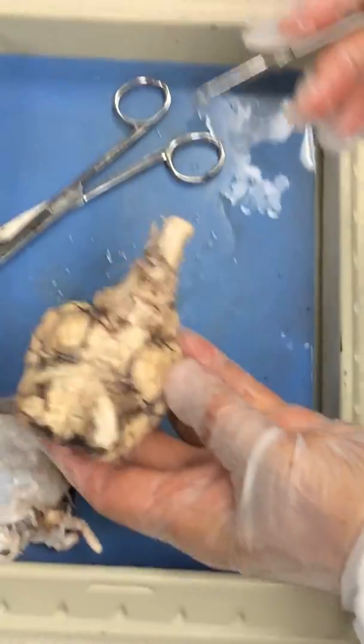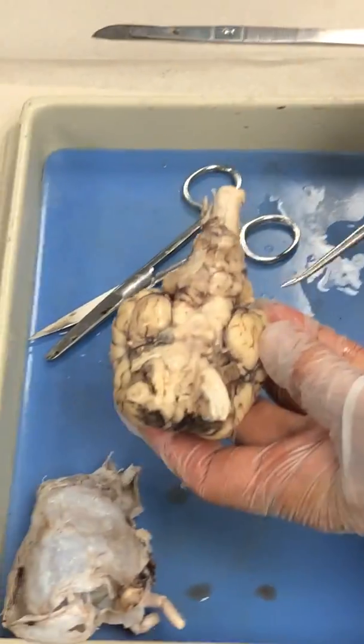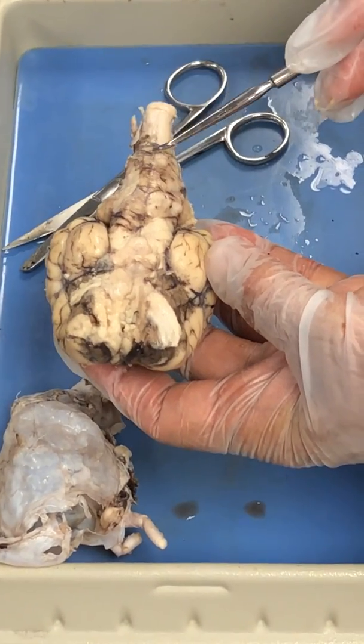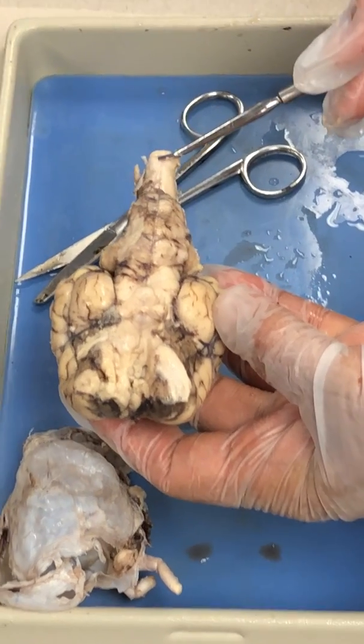If you turn the sheep brain to the other side, the ventral side, you can see the pons, and you can see the medulla oblongata, and that's the spinal cord.